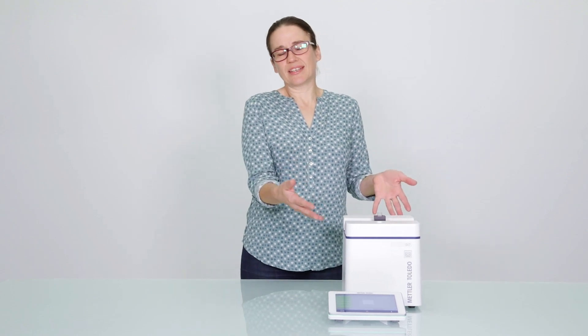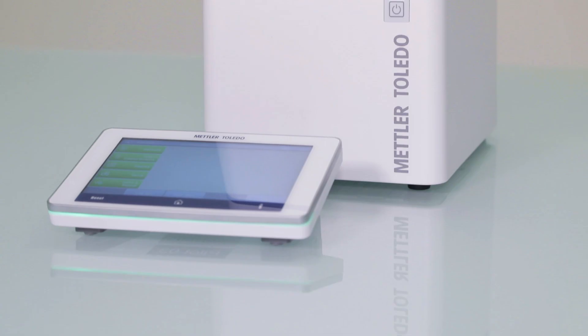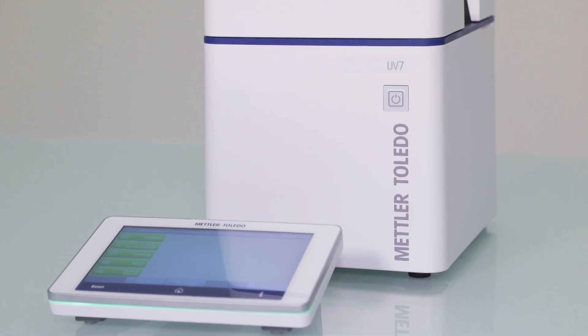Spectrophotometer. When you look at this, you might think, what is it? It looks like a box, but what does it do?